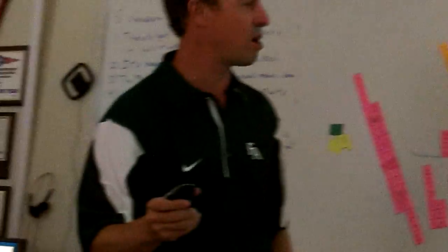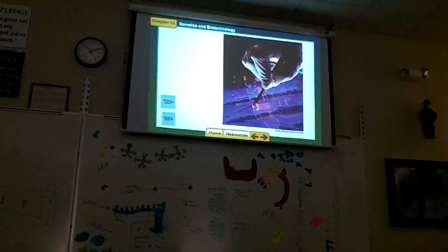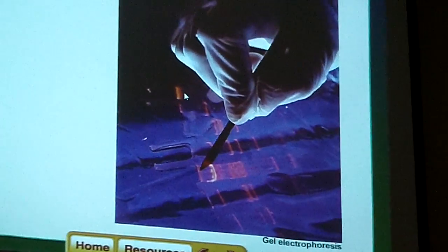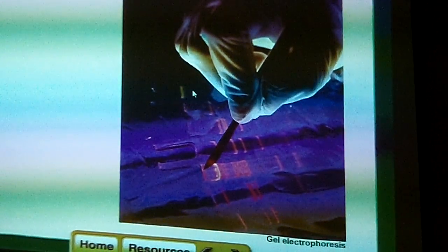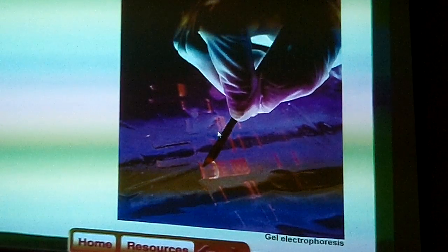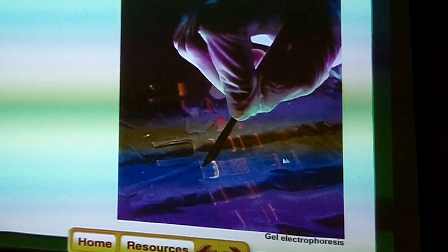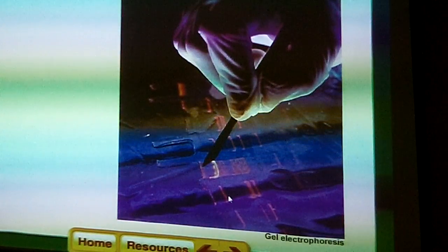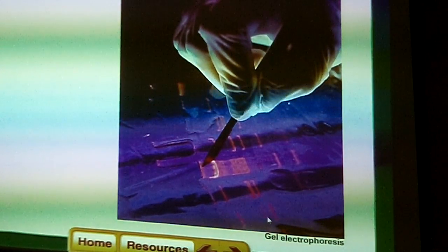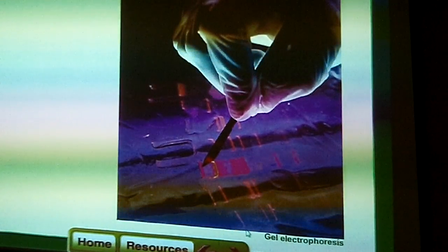So here's what the results look like. Here's the gel, you see. And for instance, they've lined up here a lot of suspects. That's Hannah, she was around too. And there's Lee's DNA, and there's Miss Bradford's, and there's Mr. Temple's, and there's Stephanie's. And there's mine. And there's what was found under the victim's fingernails. It matches mine. I'm the killer.